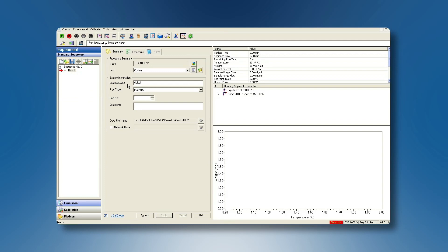In the Experiment Summary, enter the requested sample info, pan information number, and data file name.